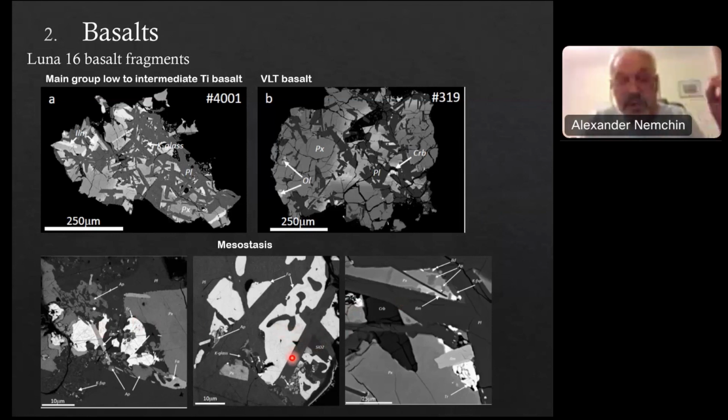Now the lower part shows the mesostasis. That's what we're trying to target, because plagioclase and pyroxene do not contain really a lot of uranium and not a lot of lead. We tried a few times to analyze them, but the counts are so low we can hardly see it. We can conclude that major components in these rocks do not contain reasonable amounts of lead we can deal with. So we're focusing on pockets of mesostasis, and they're messy, of course.